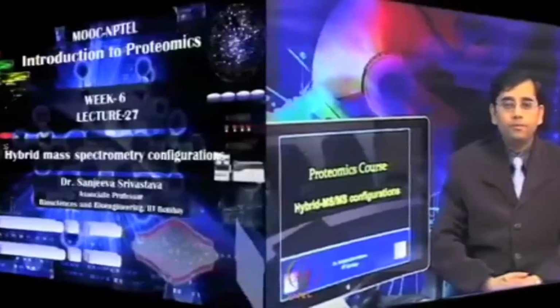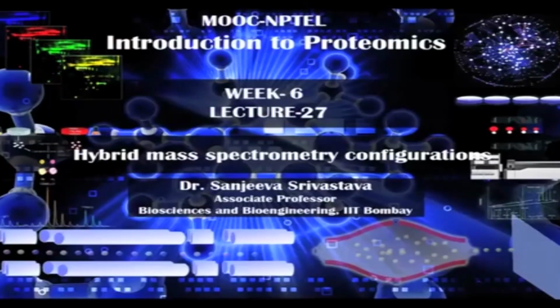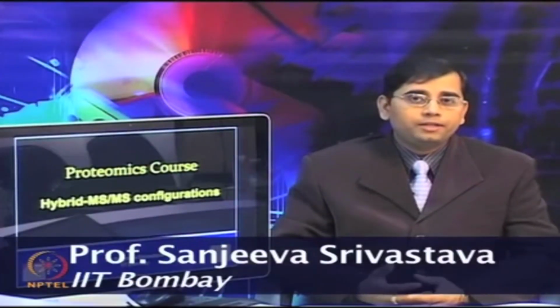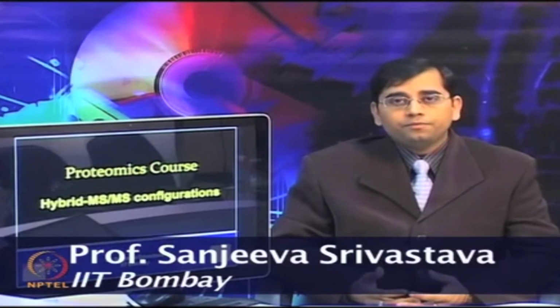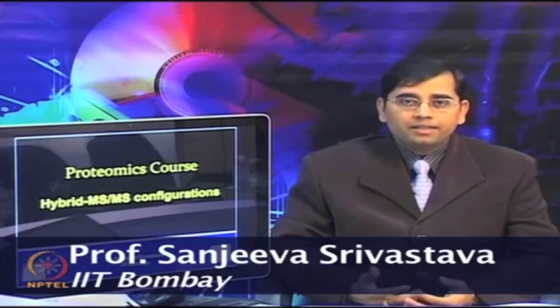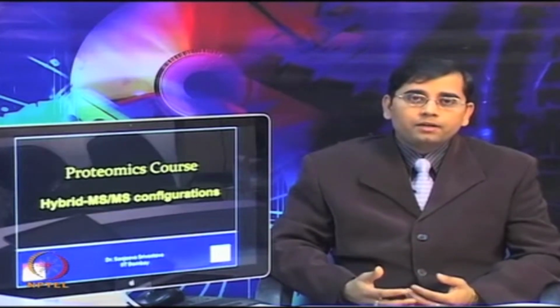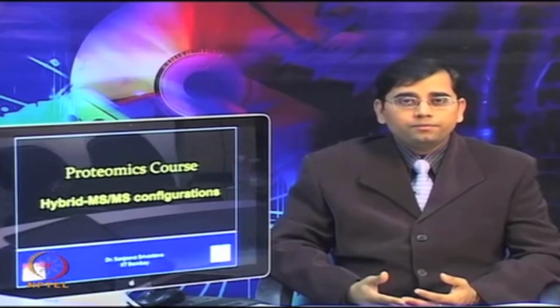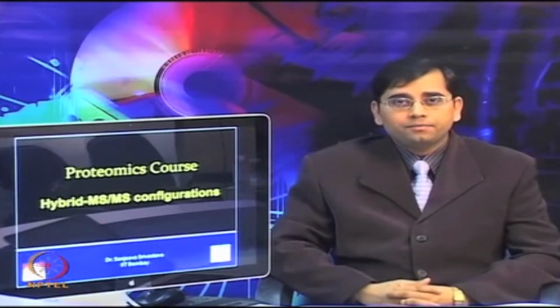Today we will talk about hybrid MS-MS configurations. As we have discussed, there are different types of mass spectrometers available, and depending upon the mass analyzers, how they can be used together, different types of MS-MS configurations, hybrid MS-MS, have emerged.